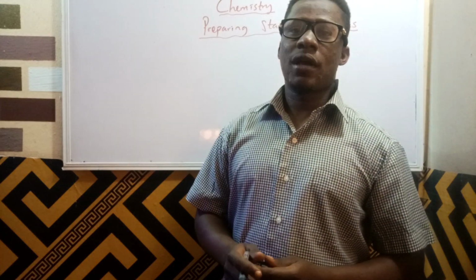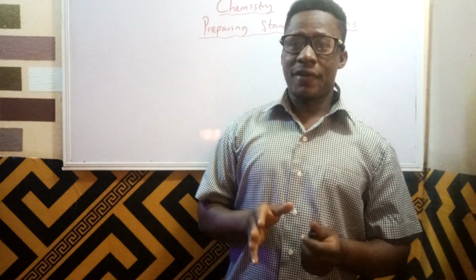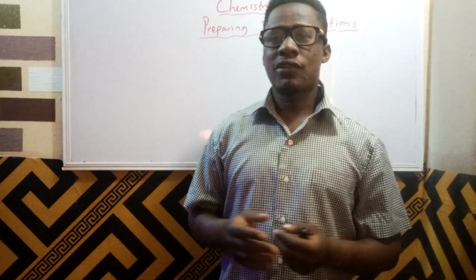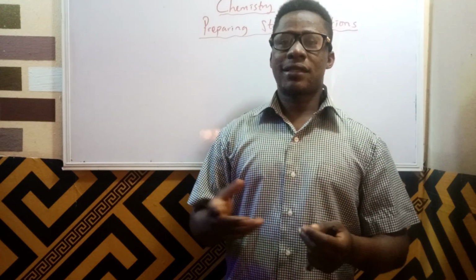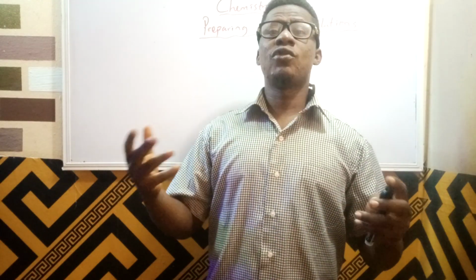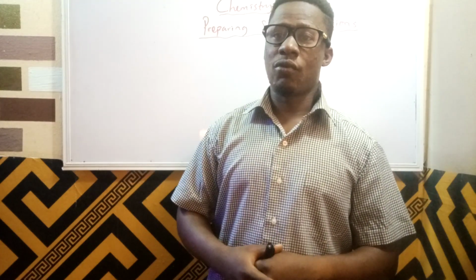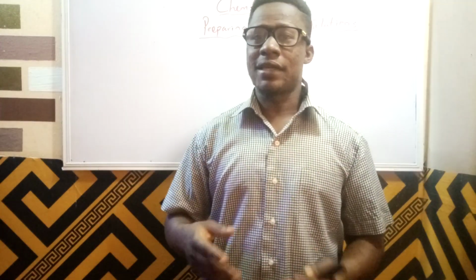In today's class we are going to look at preparing standard solution. In this very short video, I'm going to be looking at an introductory part of that. Standard solutions are solutions of known concentration. In acid-base reactions, before you carry out quantitative analysis, which is titration, you are expected to use standard solutions of either acid or base to prepare whatever titration that you want to do.